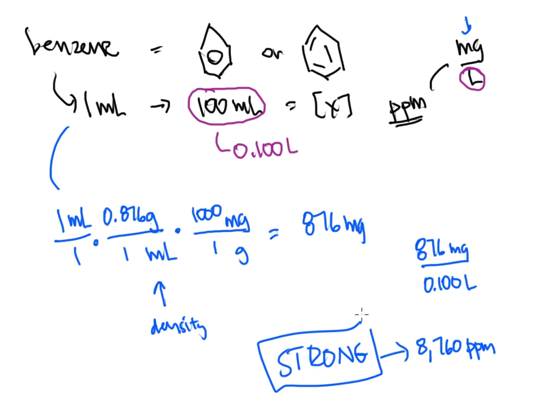So the small amount of 1 milliliter in a 100 mL volumetric flask, I have used 99 milliliters of acetone or methanol to dilute it with. That's for that one standard, and I'm probably required to make a set of 5 to 7 standards in total.